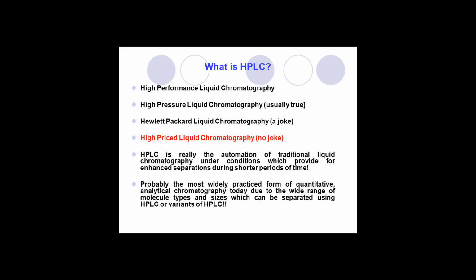HILIC, a subtechnique within HPLC. This method separates analytes based on differences in polarity. HILIC most often uses a bonded polar stationary phase and a mobile phase made primarily of acetonitrile with water as the strong component. Partition HPLC has been used historically on unbonded silica or alumina supports. Each works effectively for separating analytes by relative polar differences.